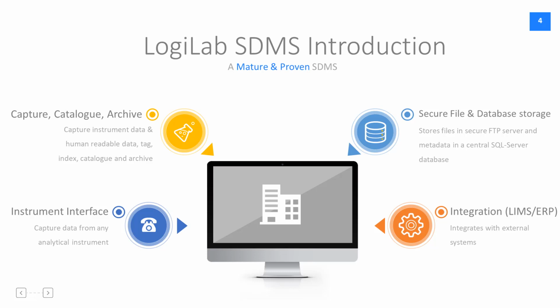Logilab SDMS is very good for interfacing your laboratory instruments by capturing data from any analytical instrument, be it a PC-controlled instrument or a standalone instrument. Data can be captured and archived.